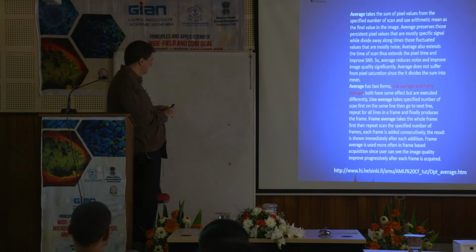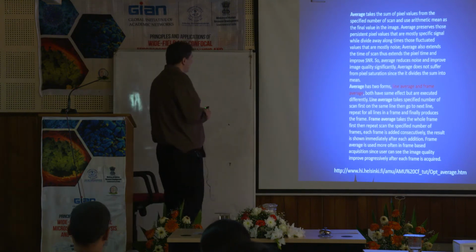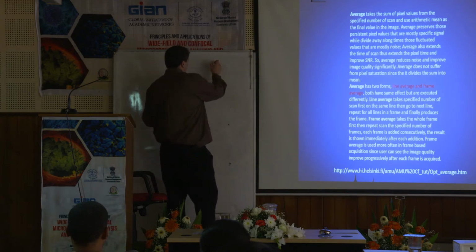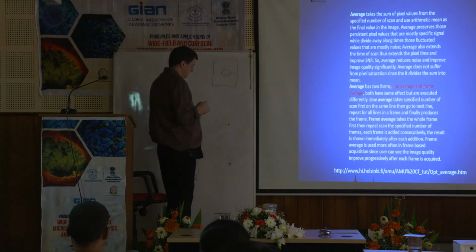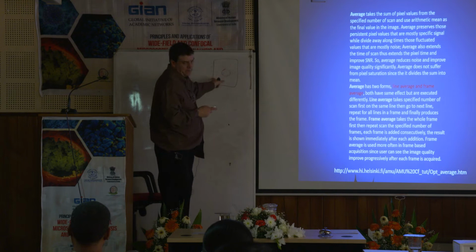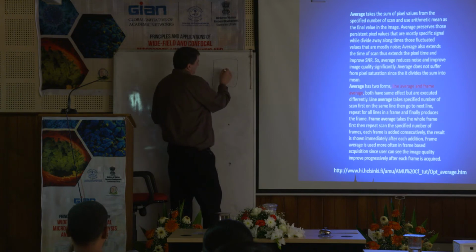Okay. So basically what this means is this. I'm going to take a picture of this cell here, right? And I'm going to use my laser, go back and forth, back and forth, back and forth across it, right? But I'm going to have parts of my cell that are real.